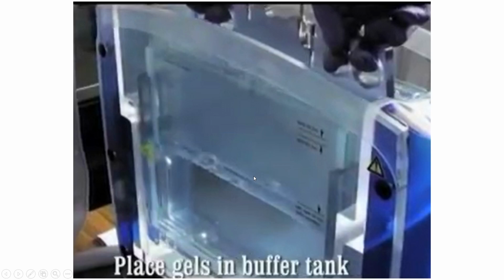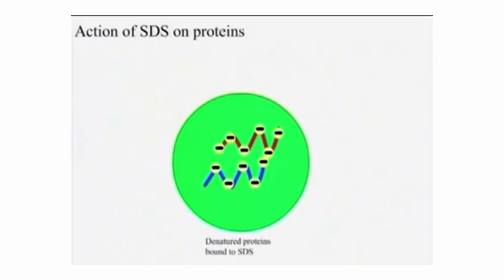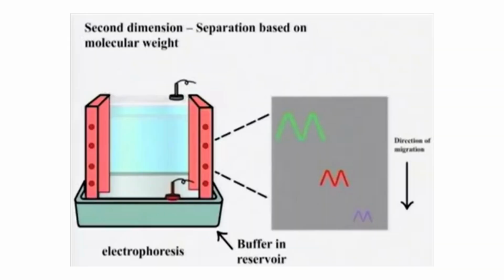And in order to avoid that, another buffer is added onto the top, and then it is placed into the tank buffer, and now the second dimension will be run, where the samples are present in the strip itself, which was run in the first dimension. Then you will place the gel in the buffer tank, and that's how the separation will take place.